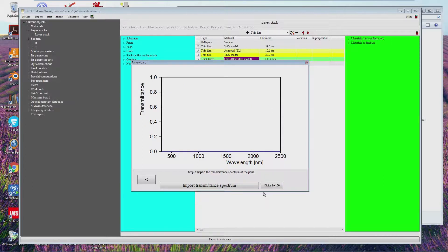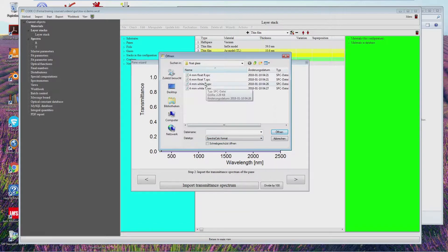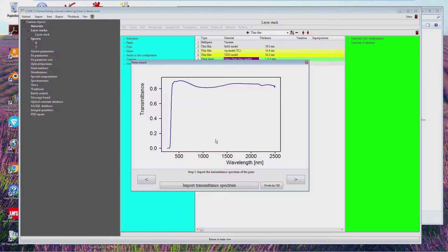The next step is the import of the measured transmittance spectrum, also in spectra calc format. You should notice that the transmittance is high, except here in the ultraviolet where it is 0 if the wavelength is small enough. That will generate some problem for this method, because the method to compute optical constants directly from reflectance and transmittance requires that both are above 0 — not 0 like this one here. So we have to exclude this range from the analysis.